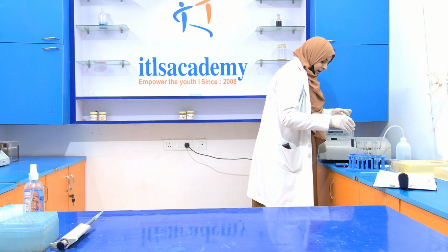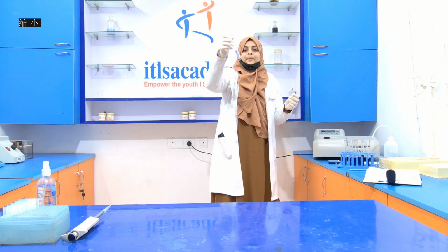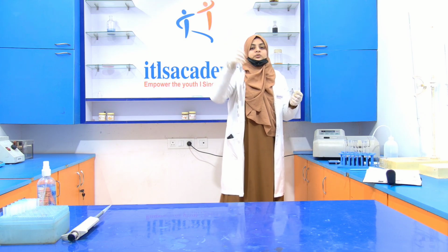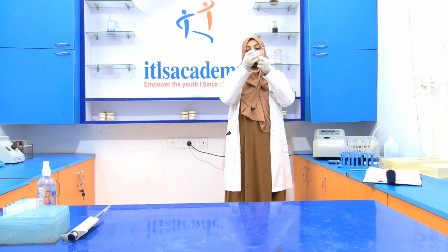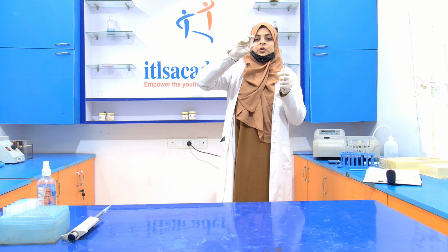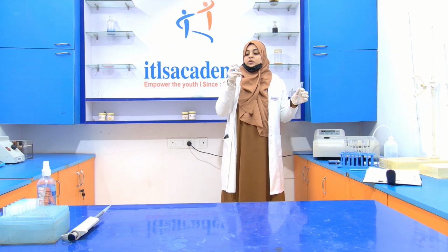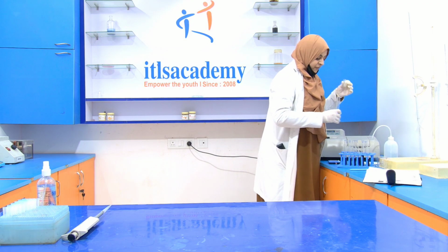Now, first of all, take the blank one. You can see that there is no color development in the blank because there is no BSA added into this solution. And this is your cuvette. A cuvette has two sides. One is transparent, and the other one is opaque. When we put this cuvette inside the spectrophotometer, we have to ensure that the opaque side is in front of us. Now fill this.